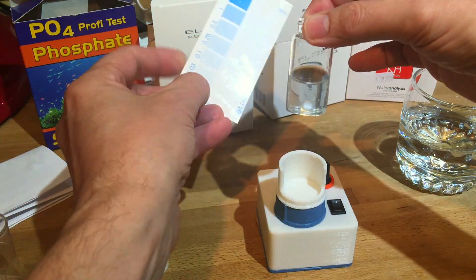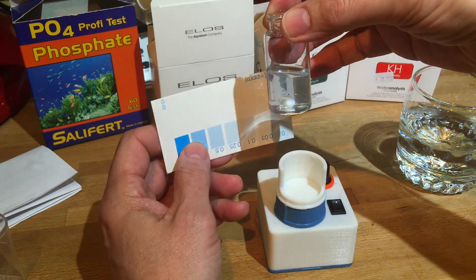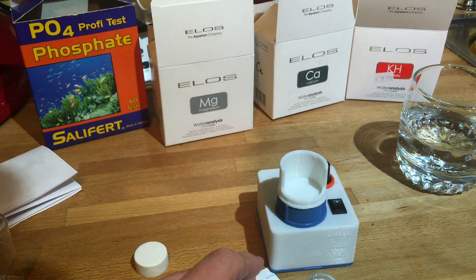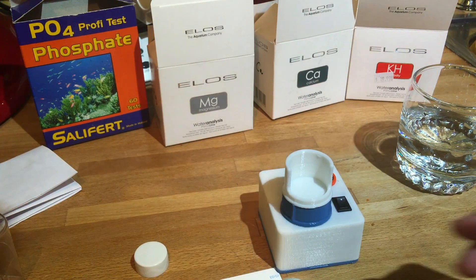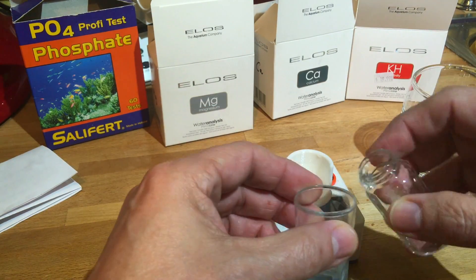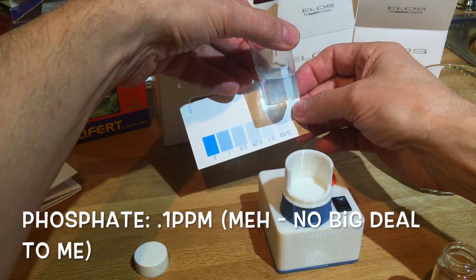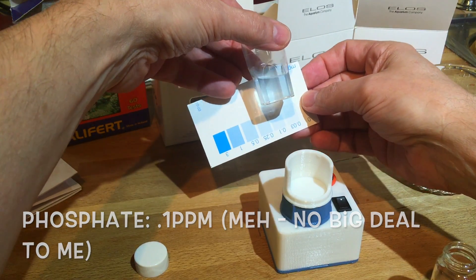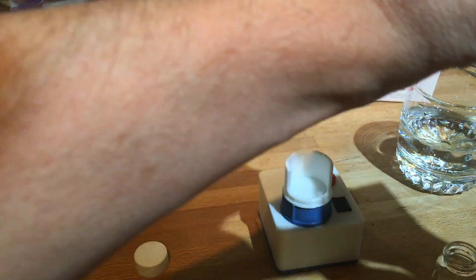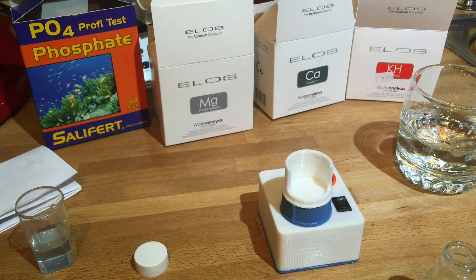Let's see if we can do this — I'm trying to keep the shadows off of it. There's a tablet in the bottom. It's mixed — we could use the beaker, right? You can see my phosphates are up a little, probably around 0.1 right now, which is not too bad. It's always tricky with phosphate because you want to be clear. Yeah, it's about 0.1. We'll do another test.